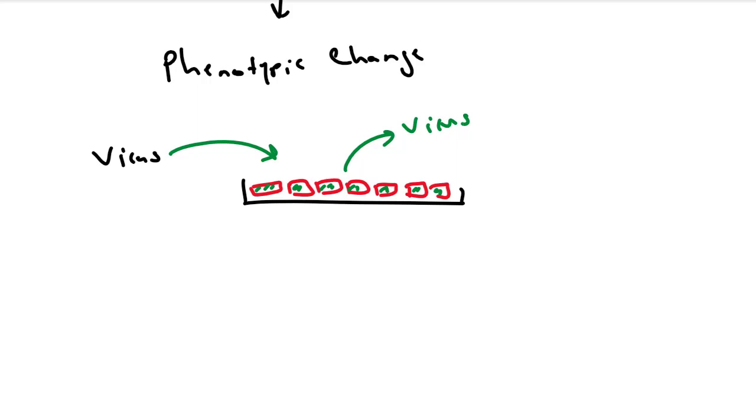Different experiments on the virology of this virus, the replication cycle of this virus. All my positive control is doing is that I infect the cells and virus comes out, and I keep track of the amount of virus coming out.